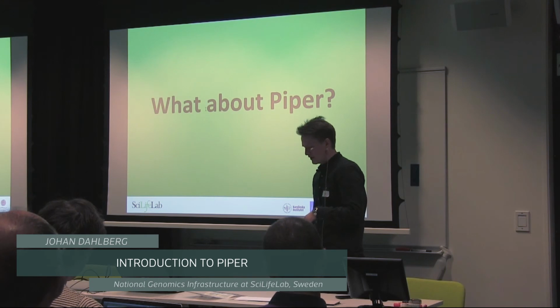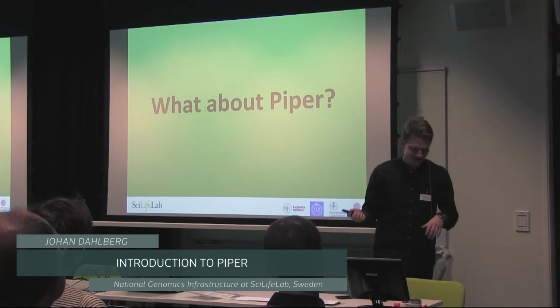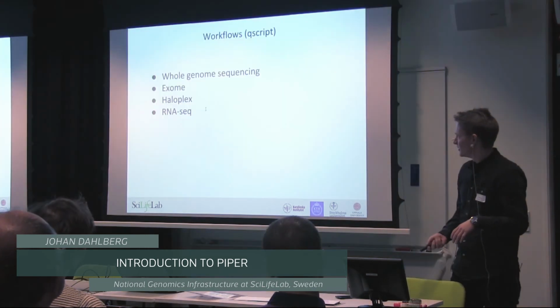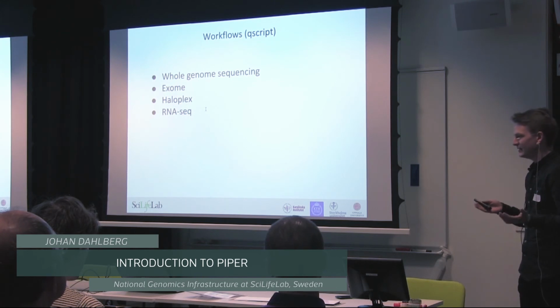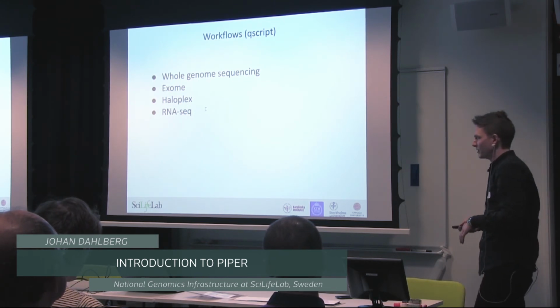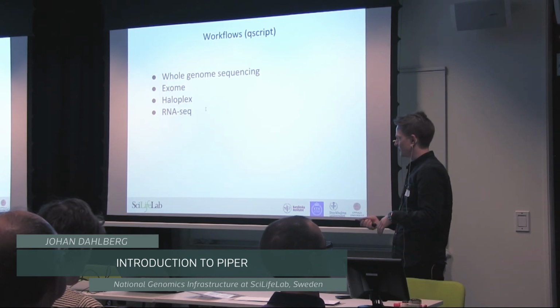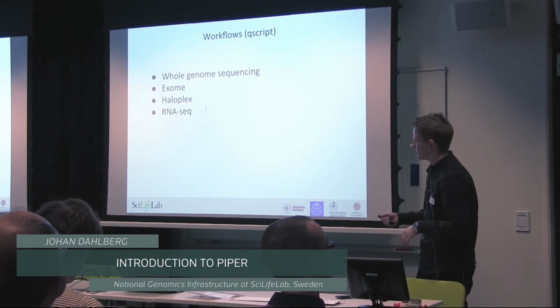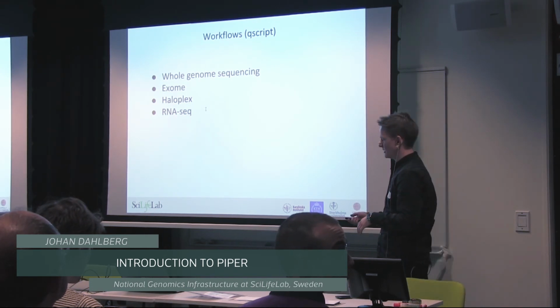So what about Piper then, which was actually the original title of the presentation? Well, as I said, Piper supports a number of ready-made workflows that we deploy on Uppmax and we run at NGI. And these support whole genome sequencing, exome sequencing. We have a Haloplex pipeline, and we have some rudimentary RNA-seq stuff in there as well.